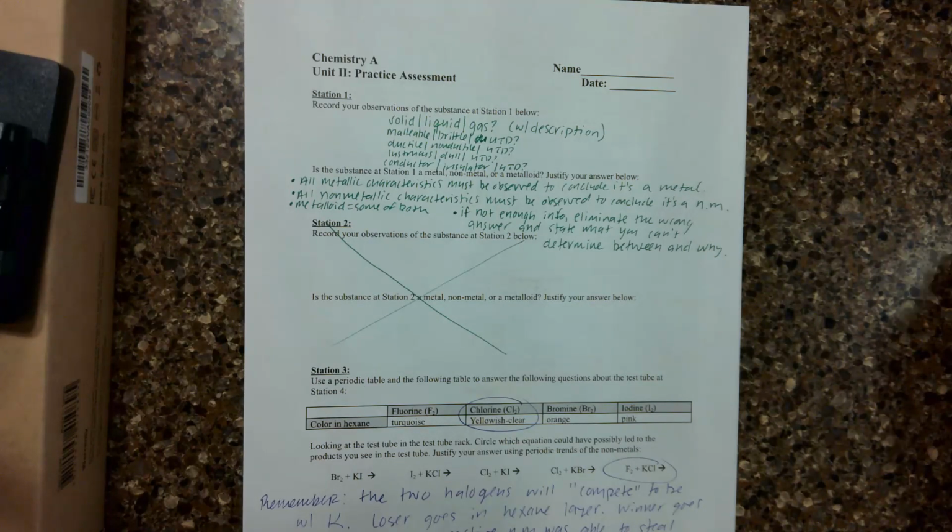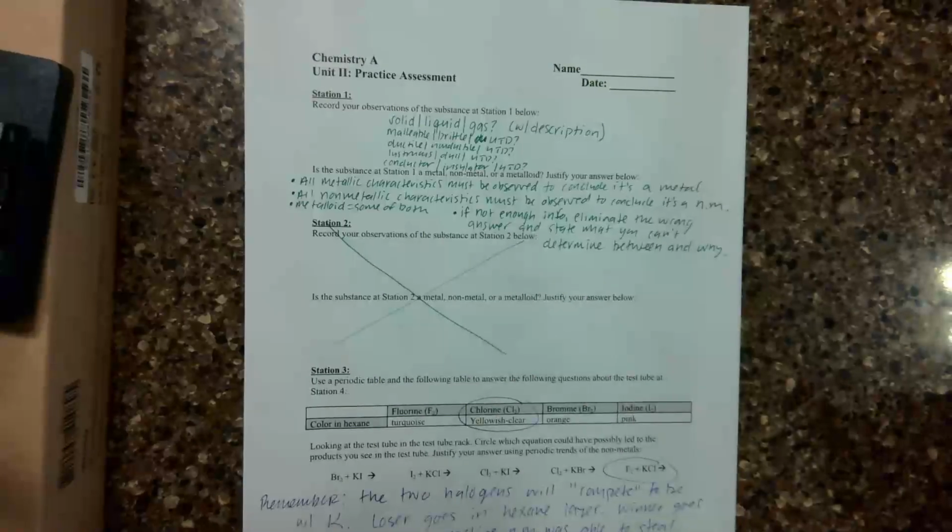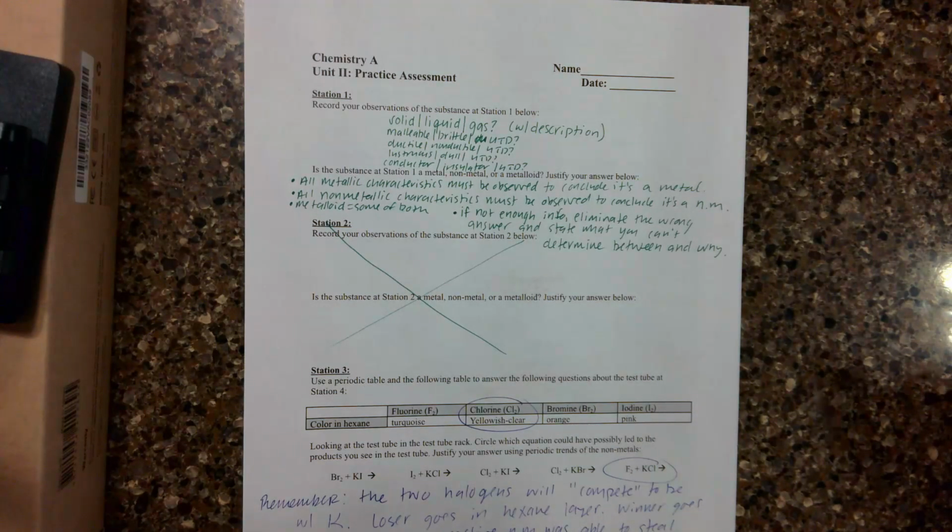So the first thing you're going to want to talk about for that sample is the state of matter, right? So is it solid, liquid, or gas? With a little description, right? So you might say it's a solid white powder, or it's a silvery liquid, or it's a clear gas, or whatever it is. Make sure that you're commenting on that first.